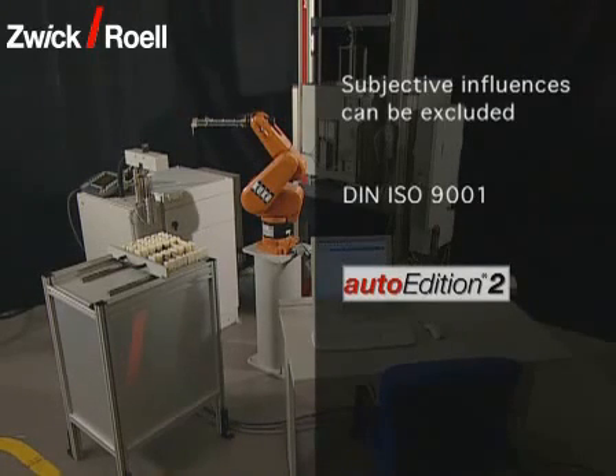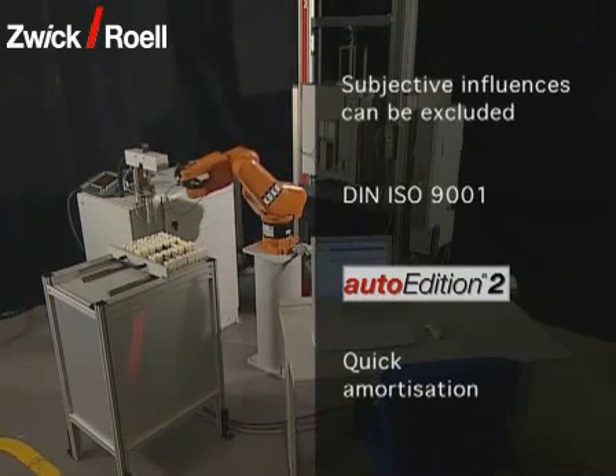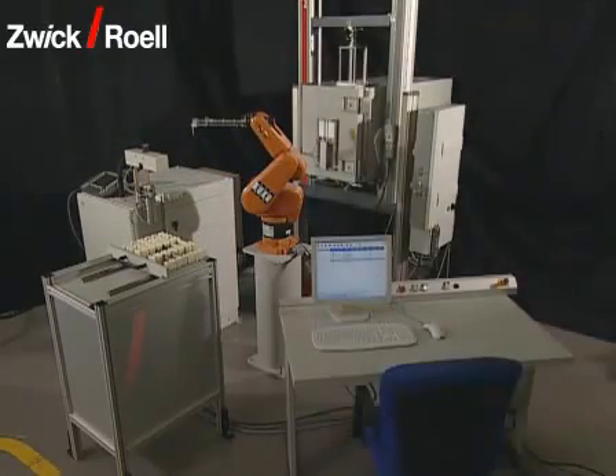With the Svik software Auto Edition 2, an automation module is used which meets the most modern technical requirements. Due to the low test costs per specimen, a testing unit with automatic specimen feed pays for itself within a period of about two years.